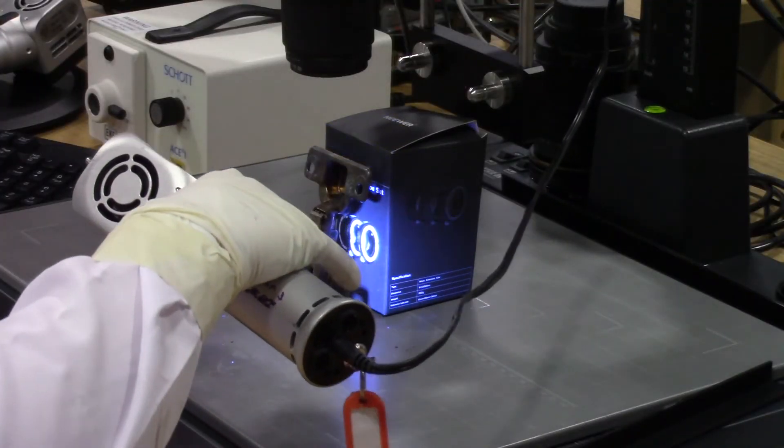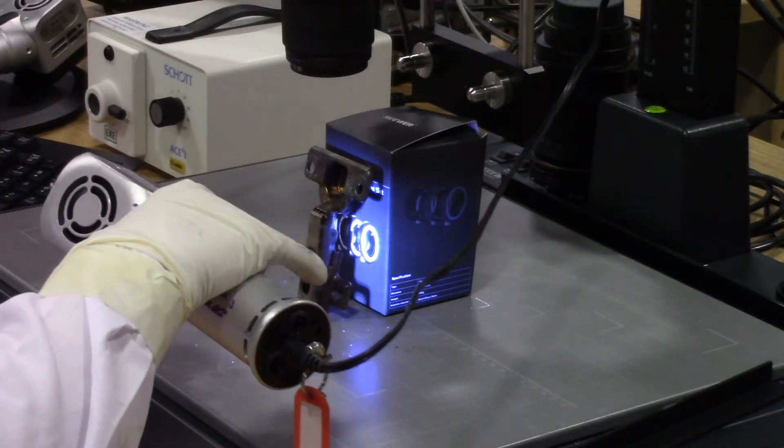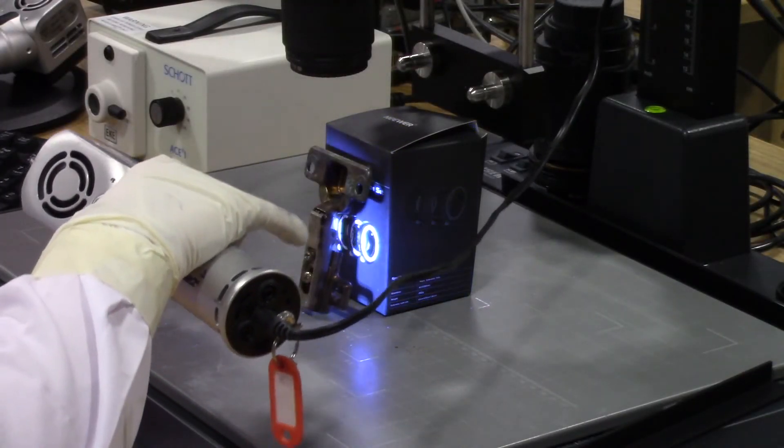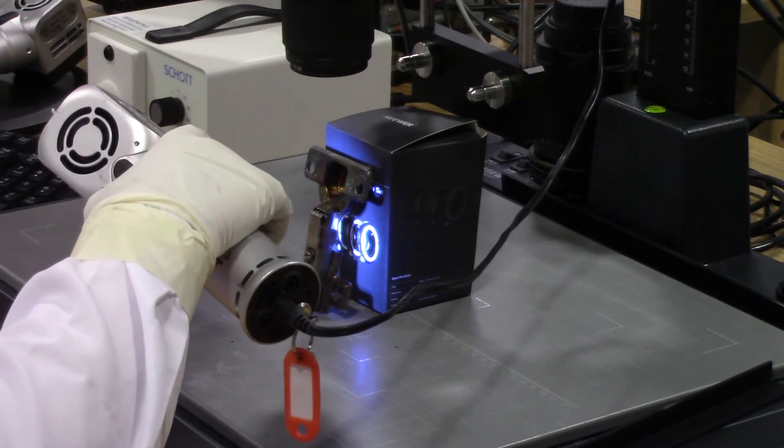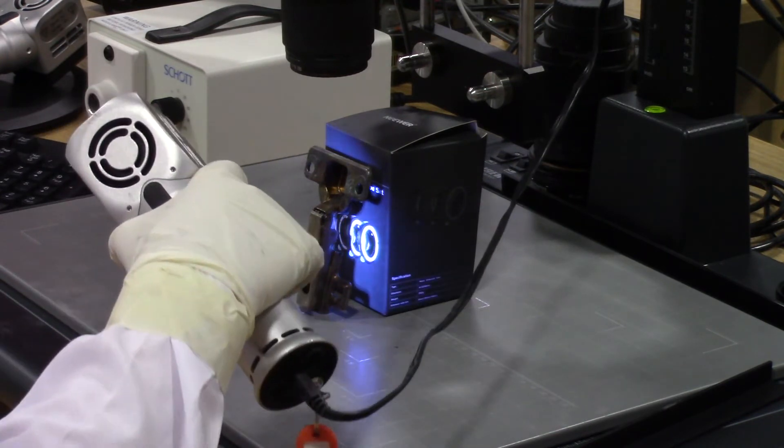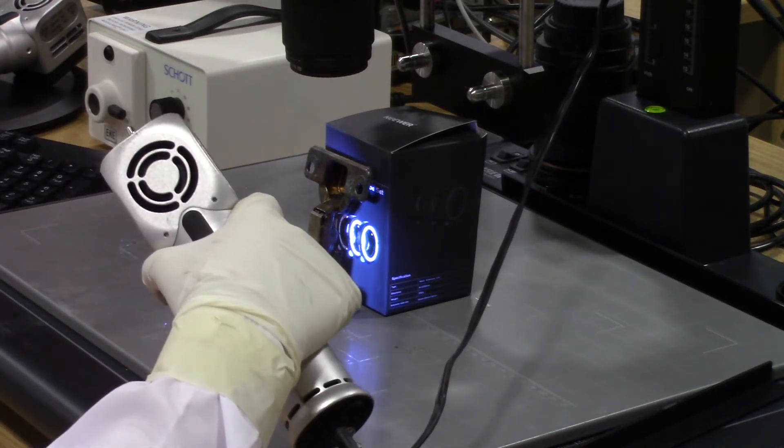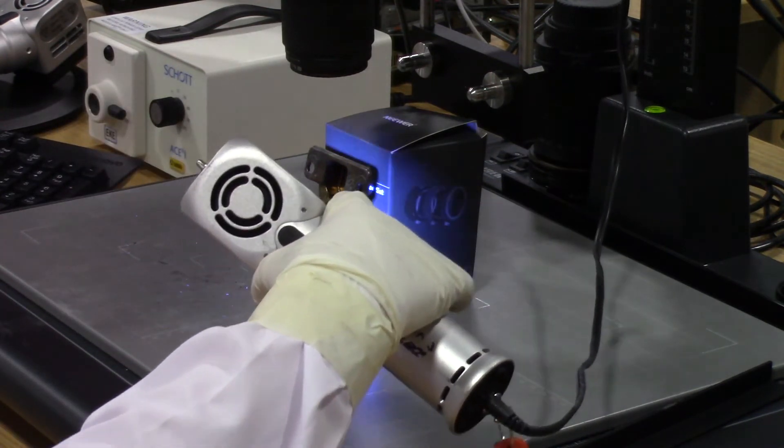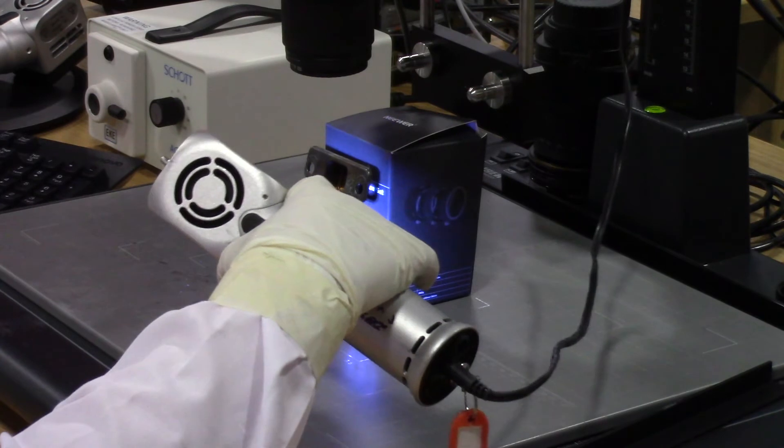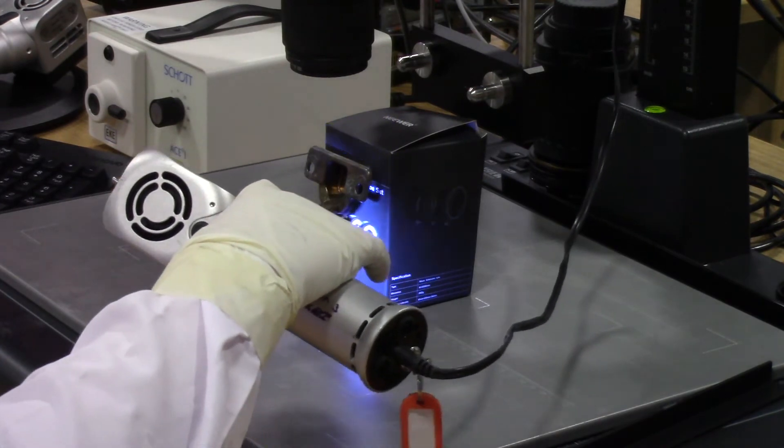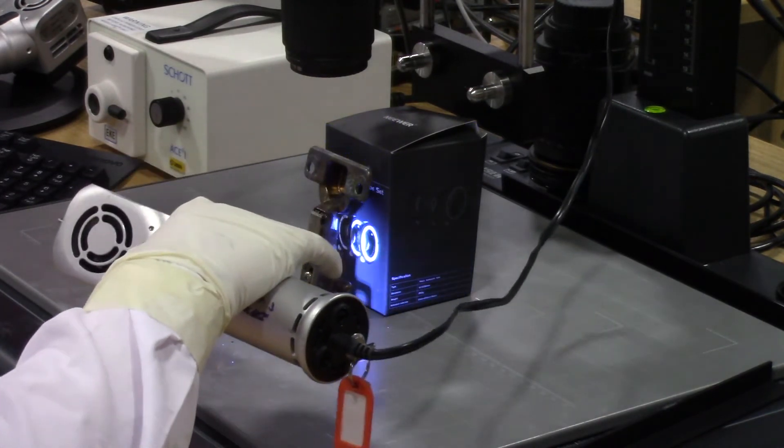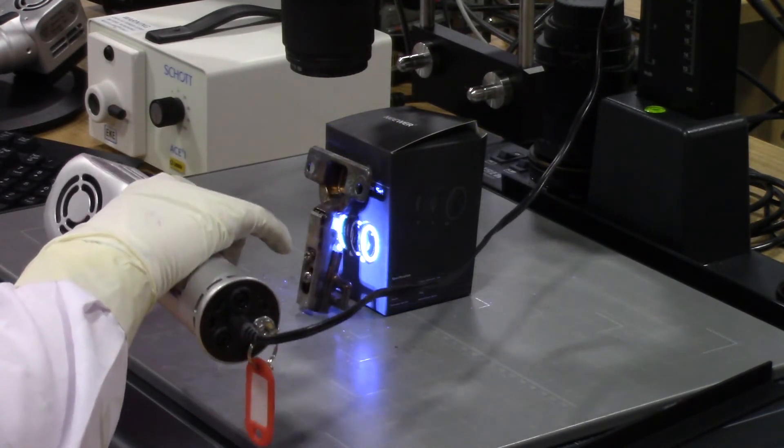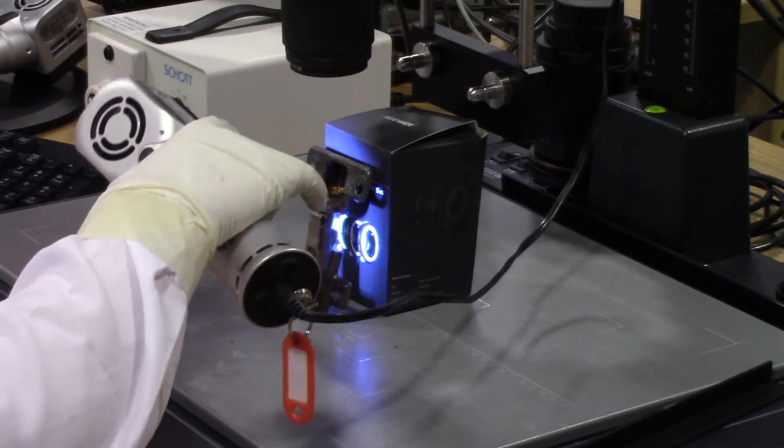Here at Foster and Freeman we also have our Recover LFT technology which allows you to recover finger marks off metals even when they've been subjected to high temperatures such as those in an arson scene or even when it's been submerged in water.